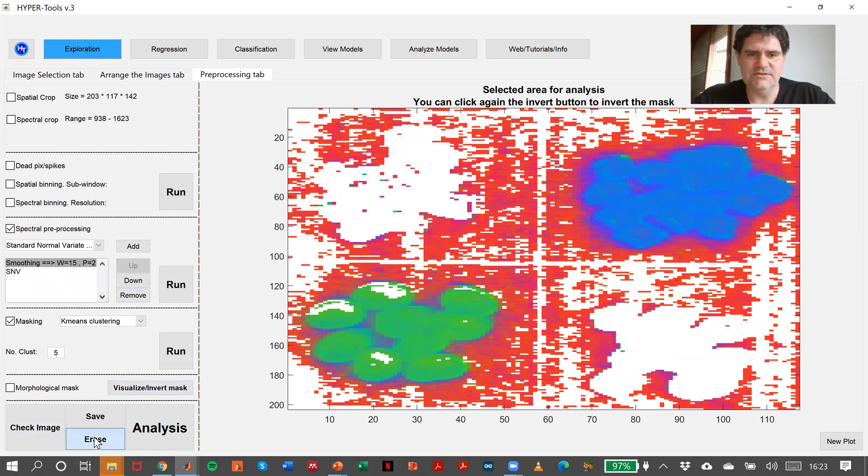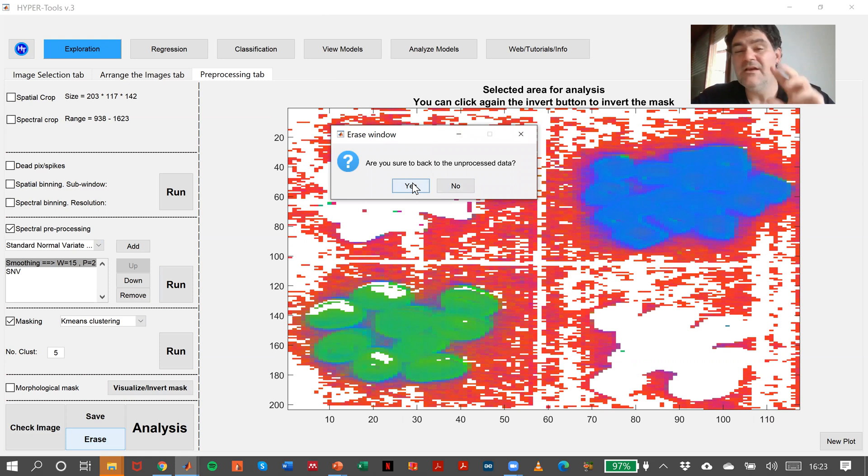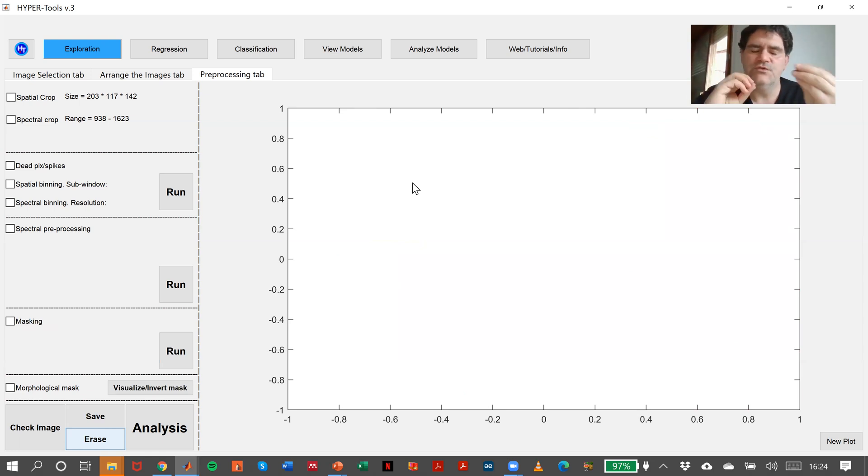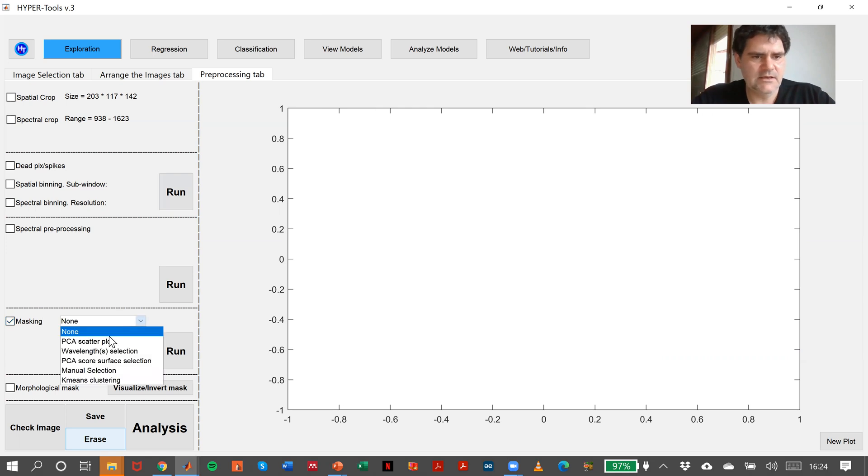So what I will do is to erase everything and redo. I selected the wrong cluster, but it doesn't matter. You see, this is the way we can operate to create a good mask. There are more methods implemented like wavelength selection.